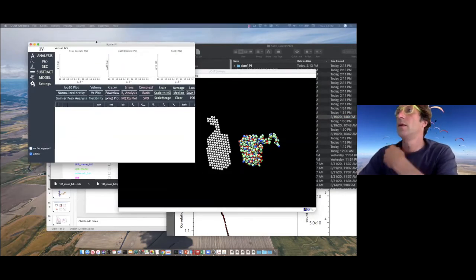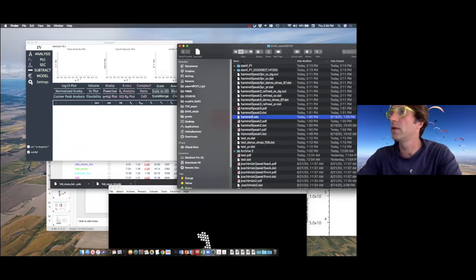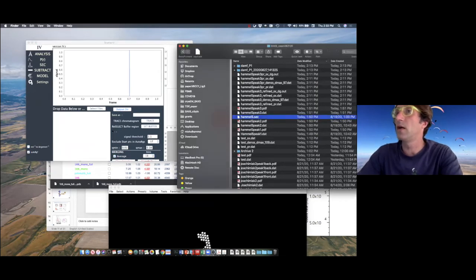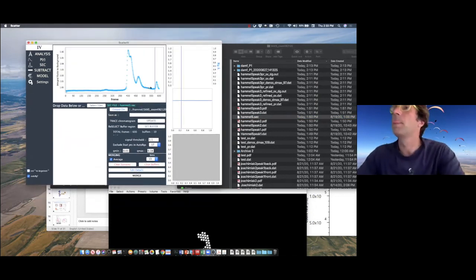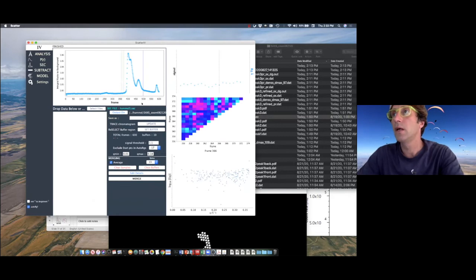Now we have this right here, and we can upload the SEC file to ScÅtter. Good. So we clear the buffer that was used for the second peak, and I'm going to make it bigger so everybody can see it. Okay, and select the buffer and update it.